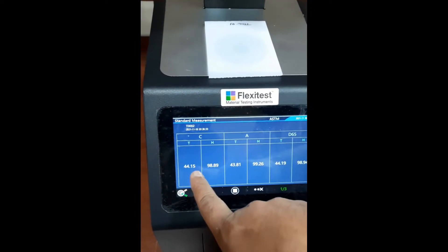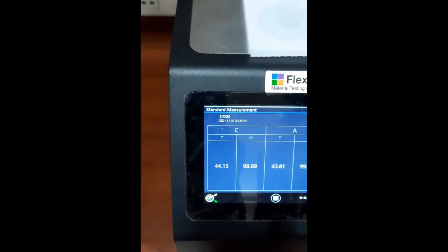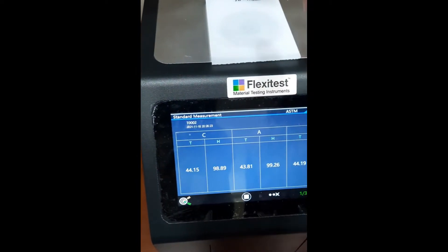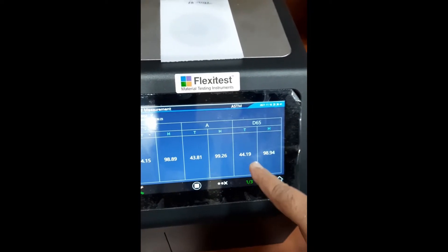So under the C light source, this is the age and total transmittance of the sample. And under the D65 light source, this is the total transmittance of the sample.